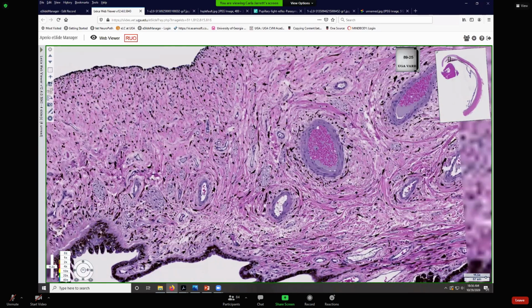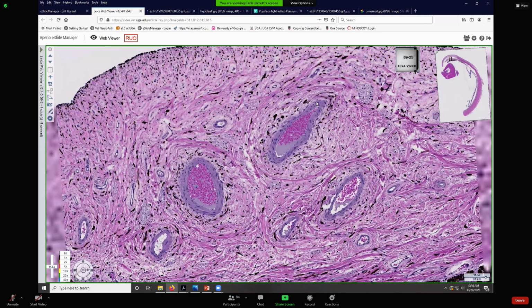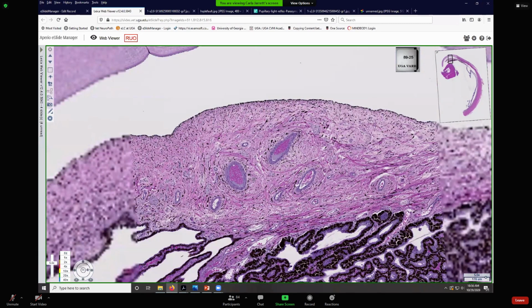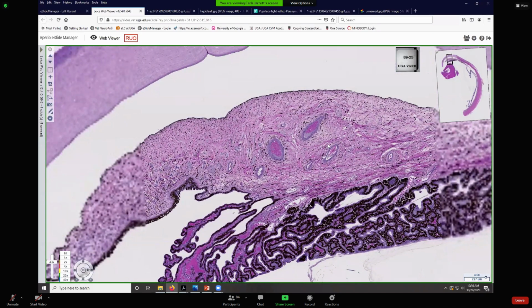It's really cool that you get really dense bundles of collagen fibers encircling the blood vessels, so that when the iris dilates, or you pull the curtain back on the window, you don't kink these blood vessels and cut off blood flow. Because this is so highly vascular, if you do surgery on the iris, it's going to bleed a lot.